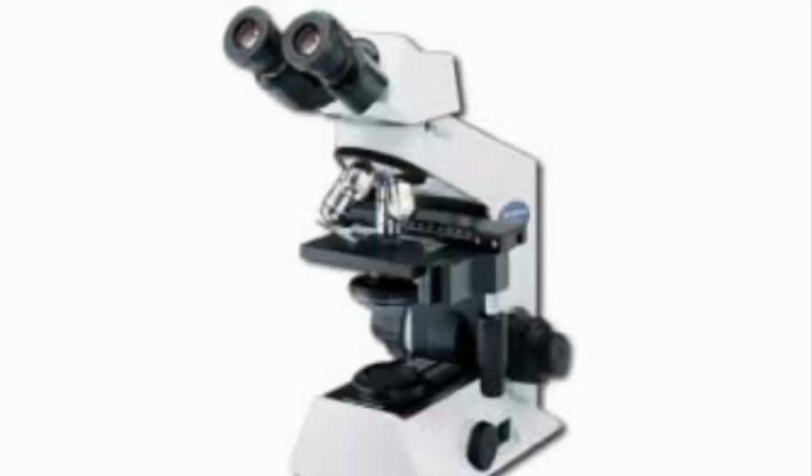So you can see the picture of a binocular compound microscope. You can see the two ocular lenses. It has a magnification of up to 10 times. But don't forget, I said there are some where the magnification is 5 times.